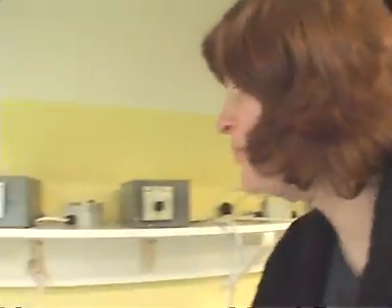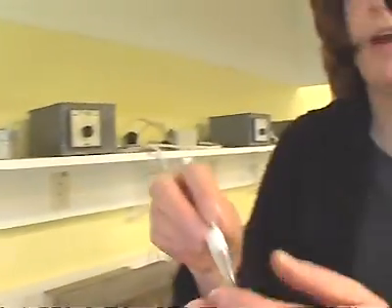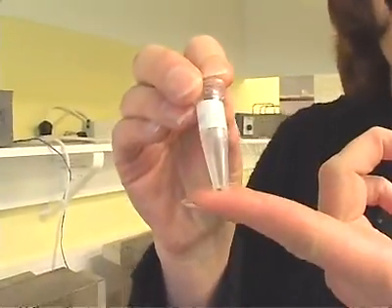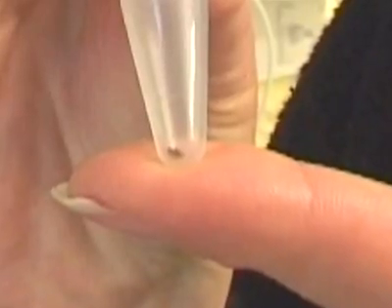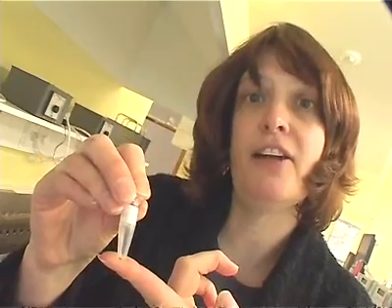CO2 plus H2 heated at 700 degrees will form graphite and water. The reaction vessel is put into the oven at 700 degrees for about 5 hours. After that, when we weigh it back, we get a small amount of graphite, about the size of a few flakes of pepper, and that's sent down to the accelerator for dating.